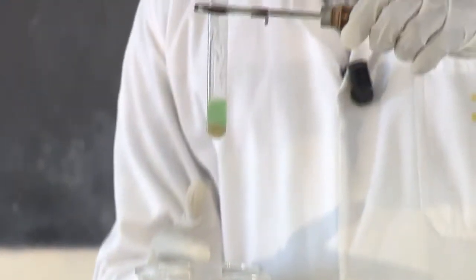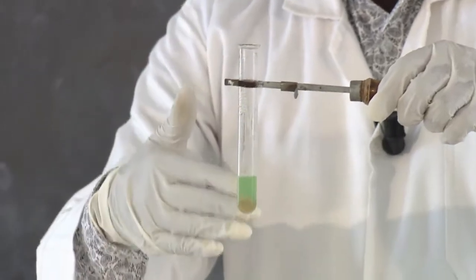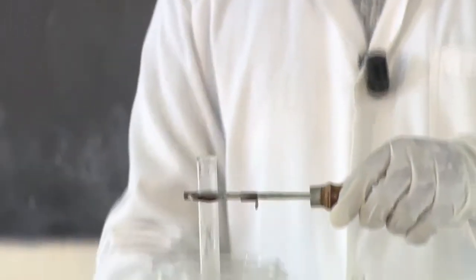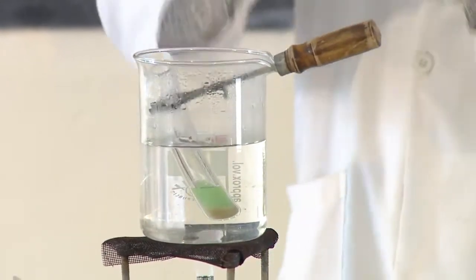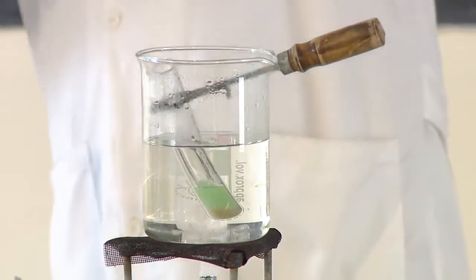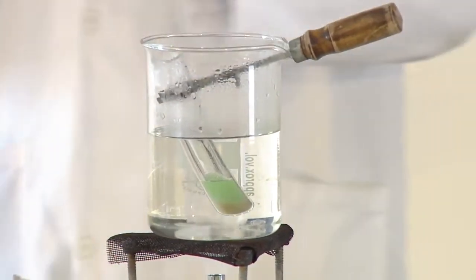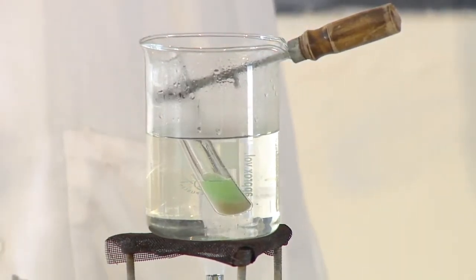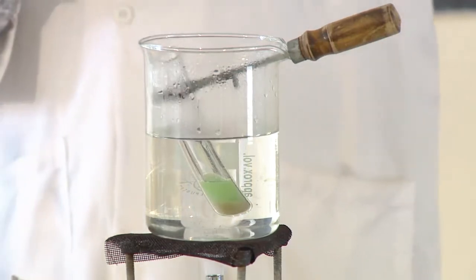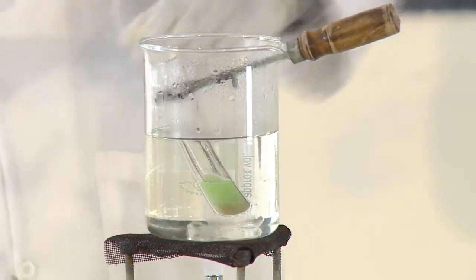As you see, the color which was blue is trying to change from blue to green, then from green to yellow, and finally to moderate orange or orange precipitate. You can have orange precipitate, moderate orange precipitate, or what you call brick red. As you are seeing, it is changing to green.